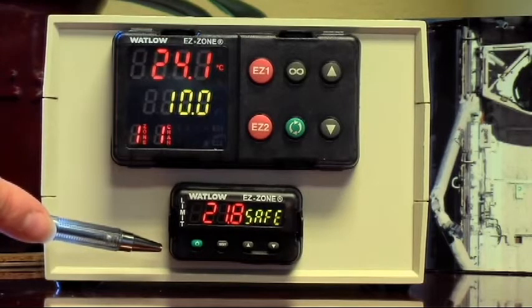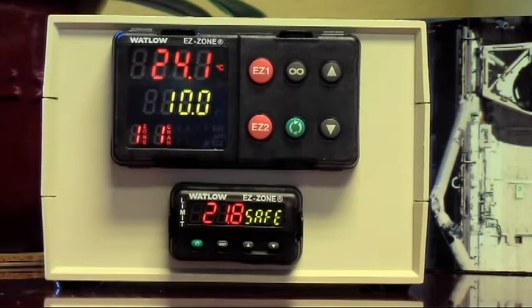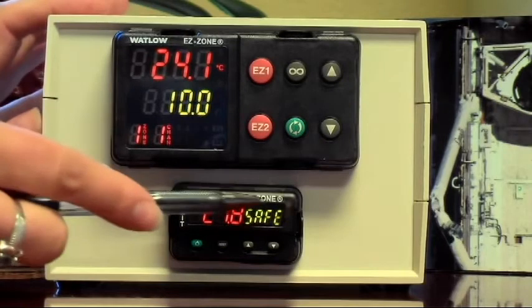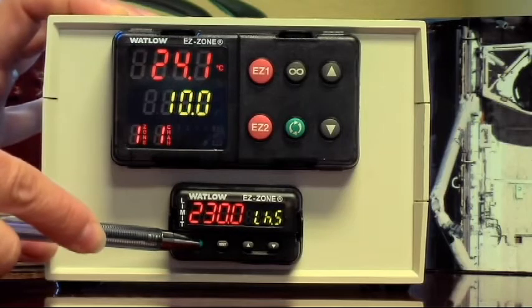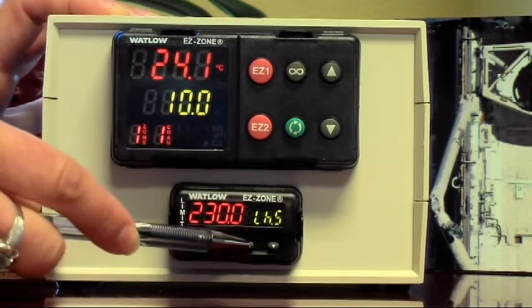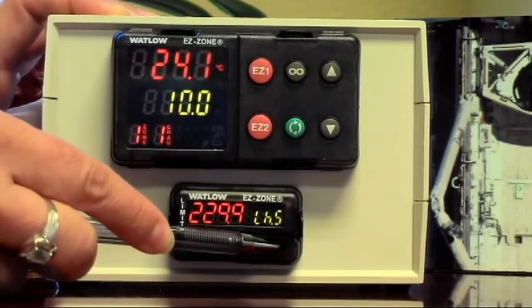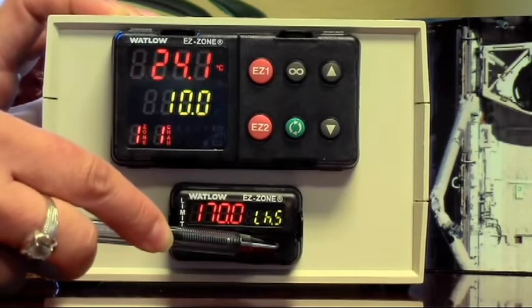So what if you don't want the oven to get more than 150 degrees C? How would you change that? On this little controller, you'd see this little green button here. You press that one time and you'll see the current setting, which is 230 degrees C. This is a really simple controller — it doesn't have a lot of different parameters, it's really just got one set point.